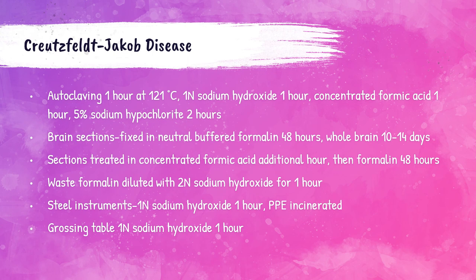Methods that can kill CJD prions include: autoclaving at 121°C for one hour, 1 normal sodium hydroxide for one hour, or concentrated formic acid for one hour, and 5% sodium hypochlorite for two hours. Brain sections need to be fixed in neutral buffered formalin for a minimum of 48 hours; whole brain specimens need to be fixed for a minimum of 10 to 14 days. Brain sections then need treatment in concentrated formic acid for an additional 48 hours, then formalin for 48 hours. Formalin used for these procedures must be diluted with 2 normal sodium hydroxide for one hour before being discarded.